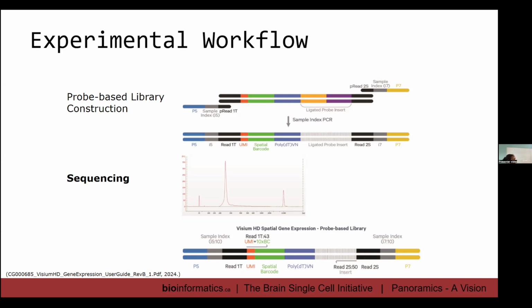We're expecting our trace to be between 200 and 300 base pair. This is a really sharp peak. This is like a perfect trace. If we had any sort of over amplification or beads still in the product, we'd be able to see it at this point. And then we have extra preamp product that we can go back to and remake the library. And after that, it's ready to go for sequencing.